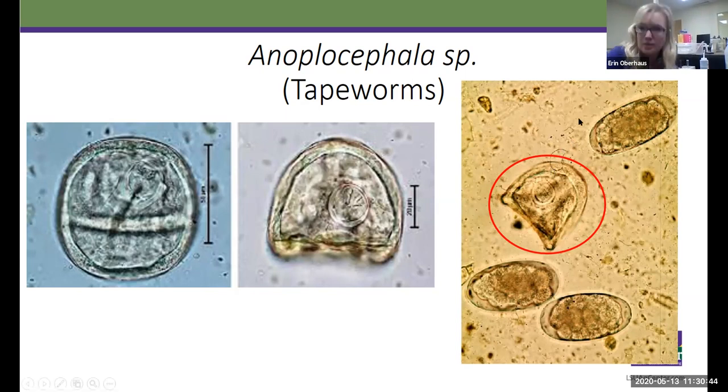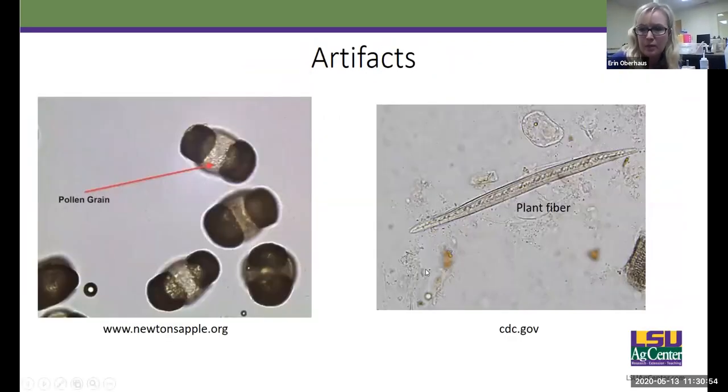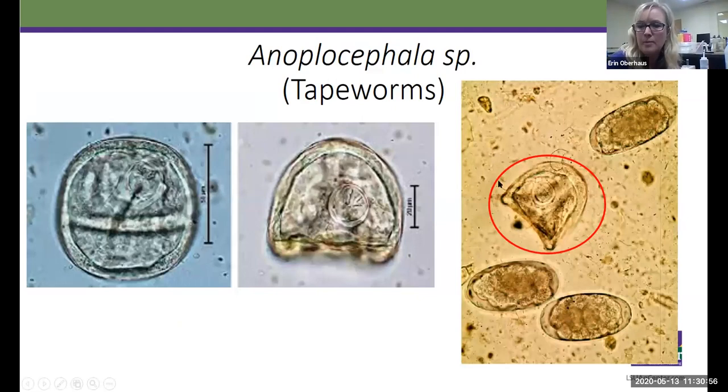over here, my picture is over the picture I'm going to show you. So this is a tapeworm egg next to several Strongyle eggs. They can appear somewhat triangular to a little more rounded depending on the species, but usually we're not looking for them in a fecal float.